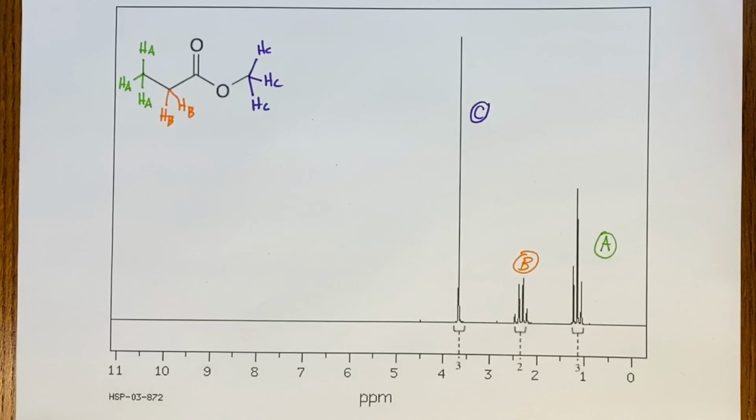As we continue to work through NMR problems, there are 2 ways that you could be asked problems. You could be given a structure and asked to make predictions about the spectrum based on what we know. You could also be given the spectrum and a chemical formula and asked to go back to the structure for the molecule. When you're given the data and the chemical formula, what you're going to do is begin by proposing structures that are consistent with the chemical formula, making predictions just like we've done here, and seeing if the data matches the predictions that you have made.